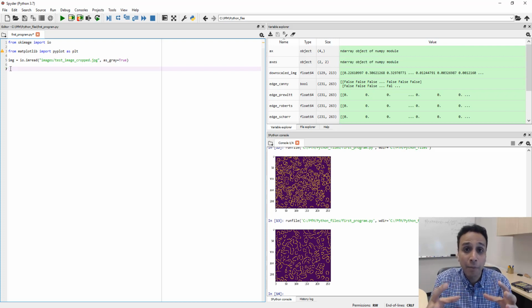The reason you pay money for microscopy software to do deconvolution is because they have all the information about the microscope, the light source and all of that. So they can calculate the point spread function, or take a pre-known point spread function, and perform the deconvolution operation.